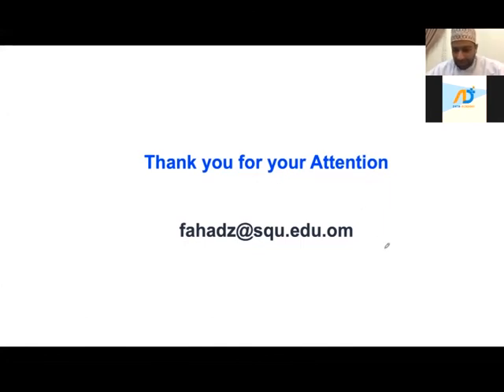So I think we are almost there. For plants, can we use real-time PCR for fragment analysis? Somebody asked me about real-time PCR and fragment analysis. Well, fragment analysis is totally different. For fragment analysis, you use the standard PCR machine, and it's also fluorescence based. To get the same answer, I already described that you can measure repeats and the size variation. But again, there is a limitation for real-time PCR. So fragment analysis is different from that one, okay?